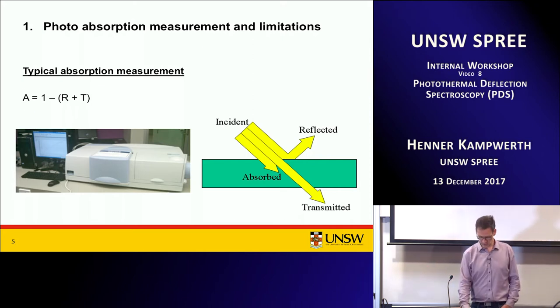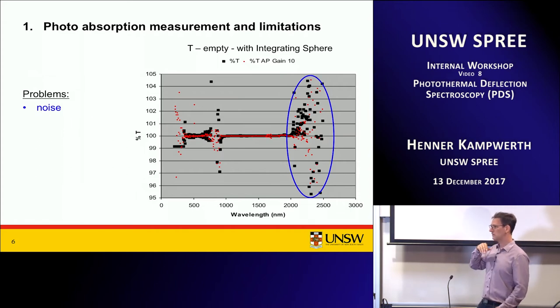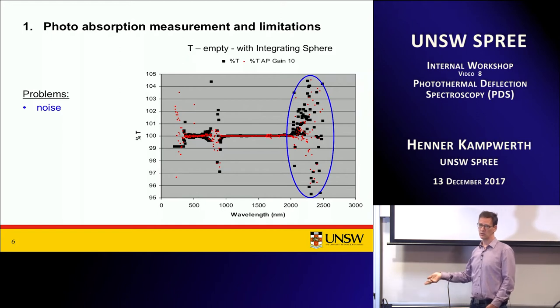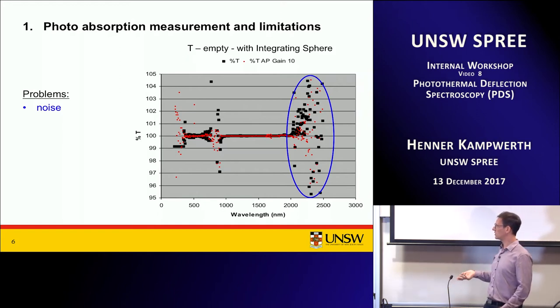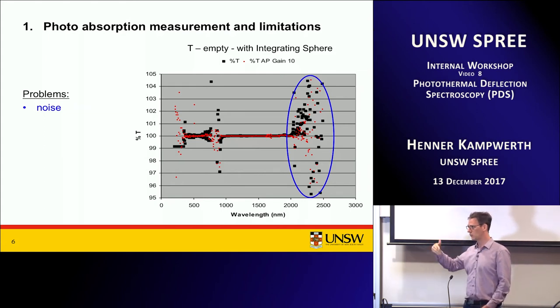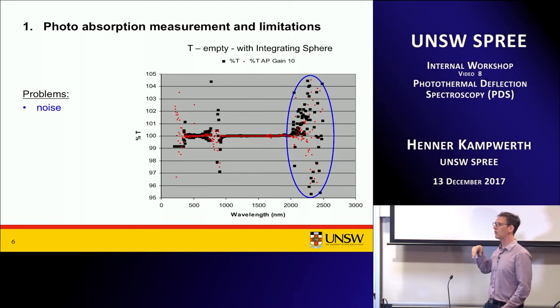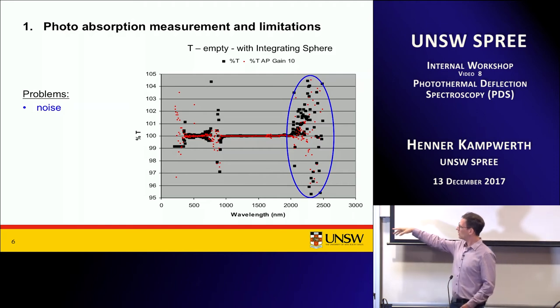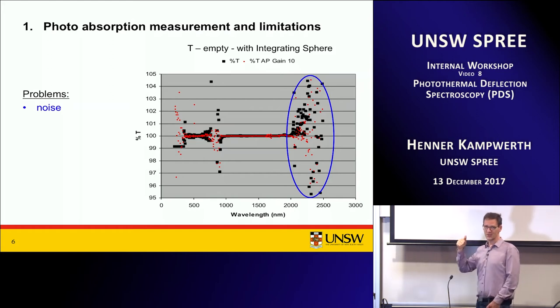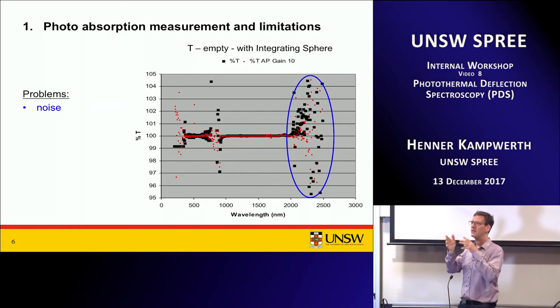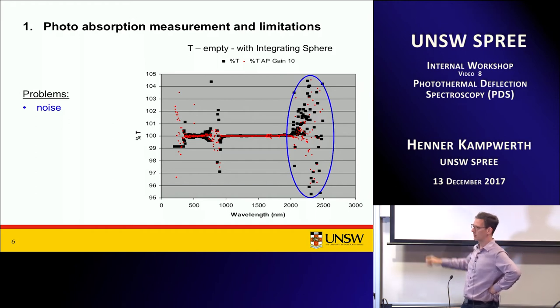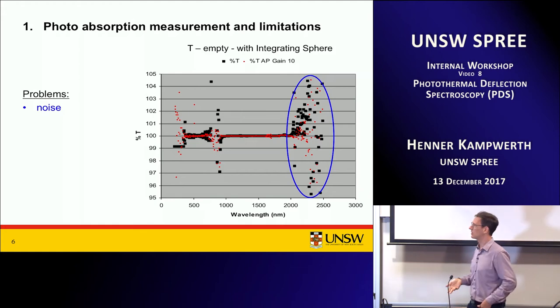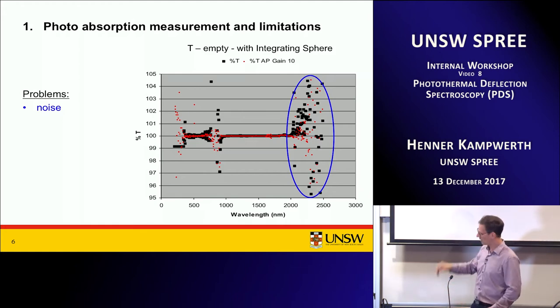It is a straightforward thing, but there are some problems. First problem is noise. The further you go into the infrared, the more detector noise you have. Everyone who has worked with photodetectors knows that as longer the detector is sensitive to infrared, the smaller the band gap and the more thermal noise you get. Here it starts at 2000 nanometers and you can see noise there. This graph shows transmission with no sample — basically a calibration run. What we should see is a straight line at 100%, but you can see noise when you go into longer infrared.